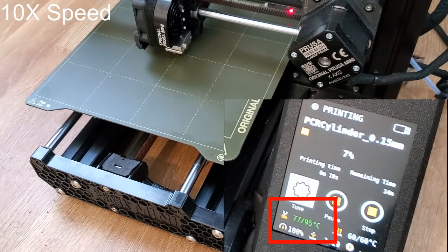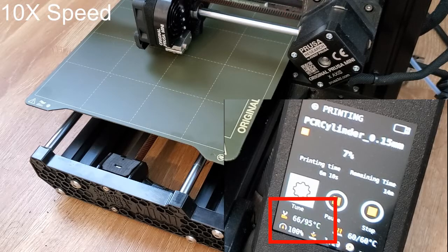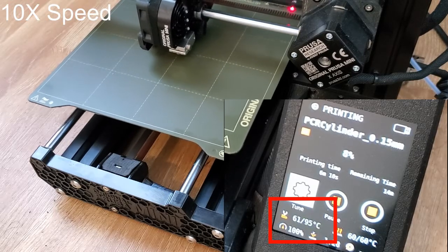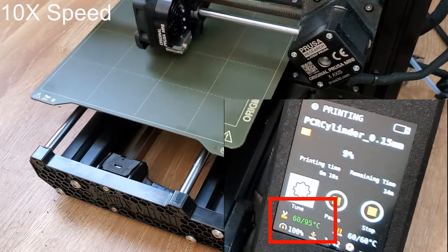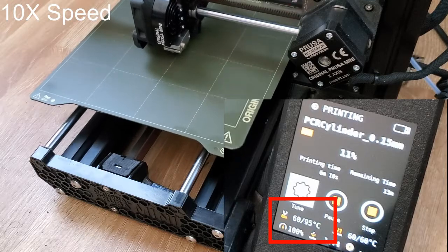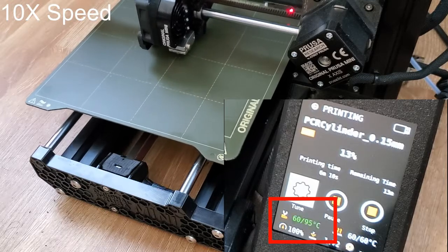To be clear, this isn't meant to be a practical hack. I mostly did it to see if I could. And it worked! I was able to cycle between three different temperatures, just like a PCR machine would.